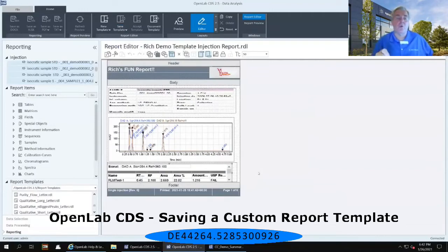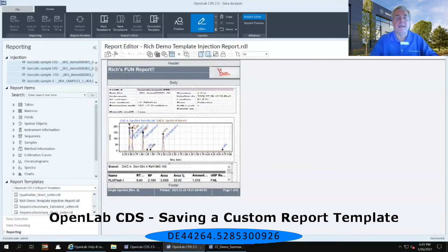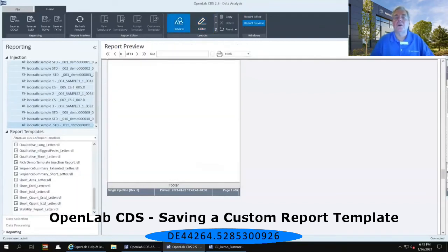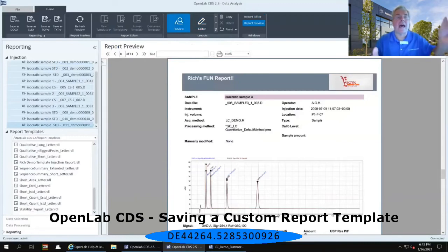Now once you save the report, first of all it becomes available in the lower left-hand window to be used in other sets of data. But more importantly, it is now available for you to re-preview your data again. So if I go back up to Preview, notice that these reporting types in the upper black ribbon on the left-hand portion — I can now save these reports as a document, as an Excel spreadsheet, as a PDF, or as a text.